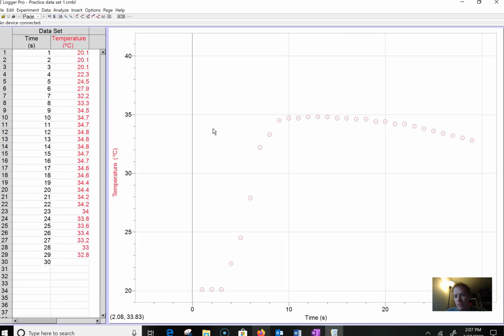In that worksheet, we have an experiment where people are trying to find the delta H of a reaction. This program can generate scientific graphs, but it's also part of a set of hardware that can be used to collect data over time. Like this one is collecting temperatures over time. It's called a data logger. It can automatically log temperature over time. So this one has logged some temperatures over time for reaction 1.